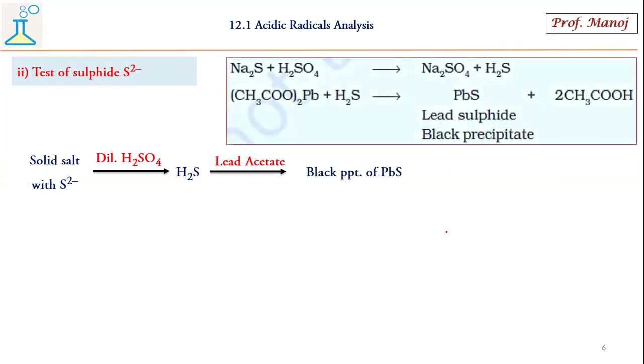So to show the chemical actual reaction, you can see these are the reactions. Now, whatever is given here as sulfide, it is written here as Na2S. So Na2S is taken in form of sulfide. Na2SO4 and H2S. So this is the part which you can see written over here. Lead acetate is this one. And black PPT produced is this one. So from the NCERT reaction, I have picked up the important things and made this kind of thing. So for exams, that is rather first important.